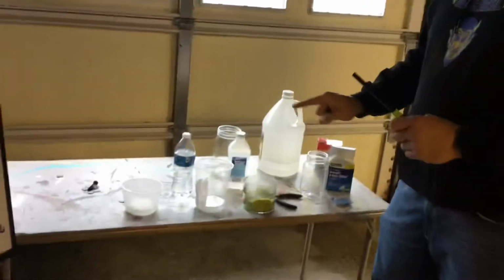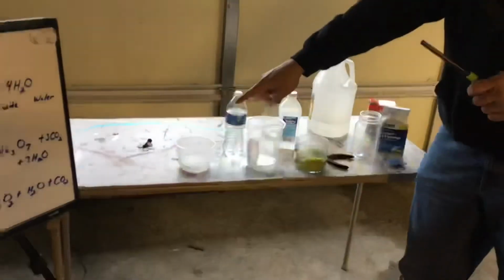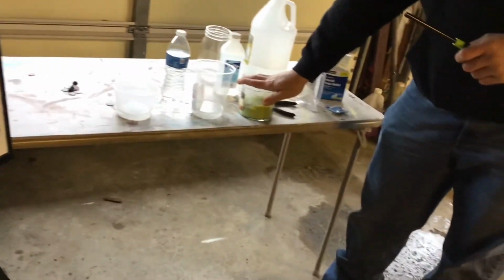Those are chemical reactions. In each case, you have a new substance made. You have an energy change. And, well, not this. This had a light released. These ones, this one would become colder. This one actually heats up a little bit. But the carbon dioxide gas is clearly produced.